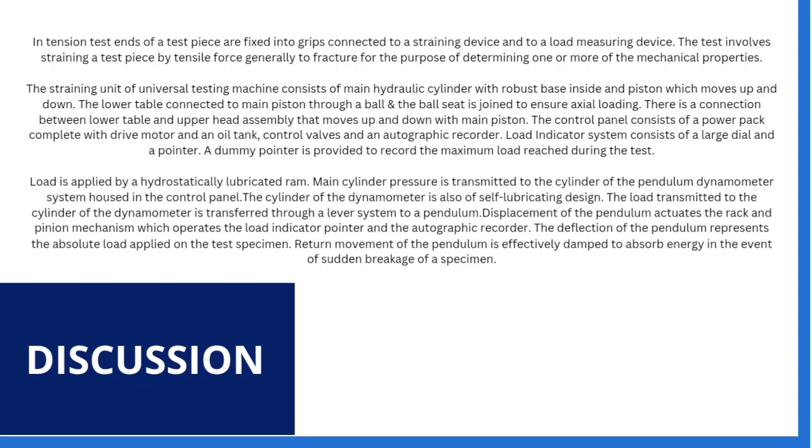The deflection of the pendulum represents the absolute load applied on the test specimen. Return movement of the pendulum is effectively dampened to absorb energy in the event of sudden breakage of a specimen.